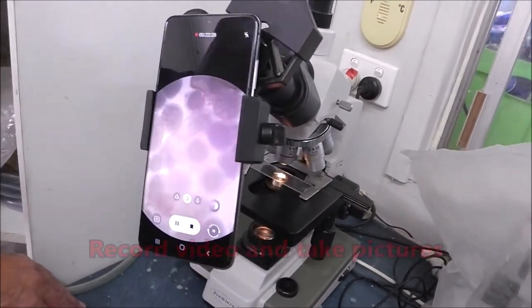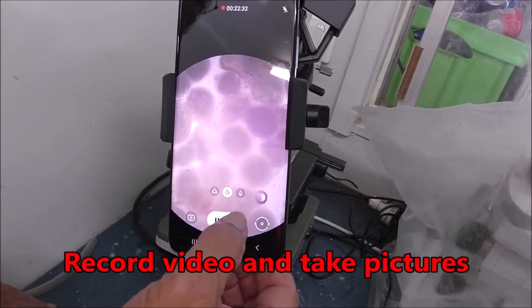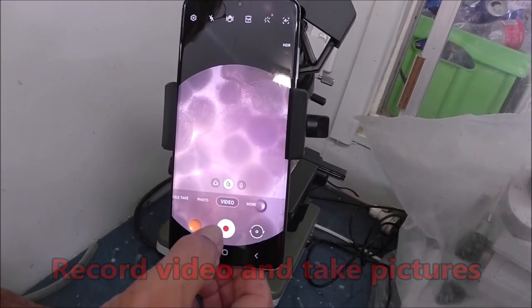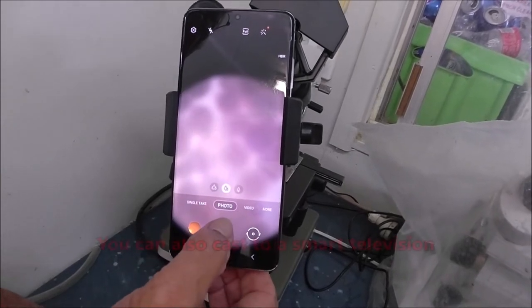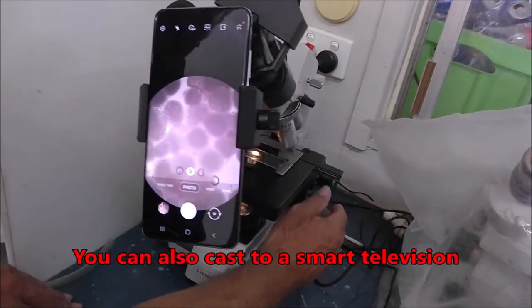Notice on the camera, you don't need to look down the lens of the microscope. You can just look on your phone. I can take some pictures. Photo. One, two. Adjust the focus.